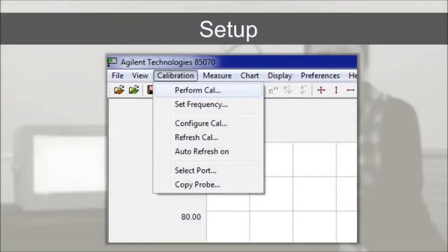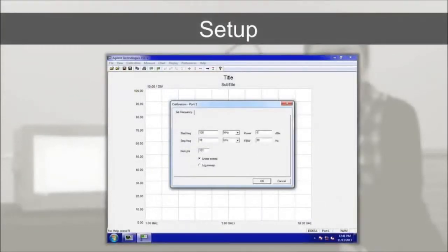You can change frequency range, power, and other parameters. The next step is calibration. Click calibration, perform cal. Prompts will appear to instruct you to connect standards.